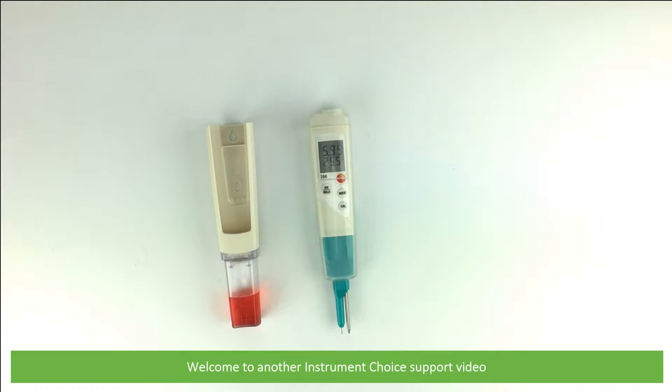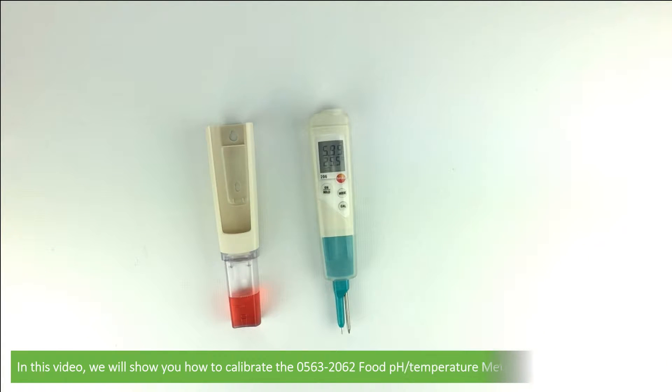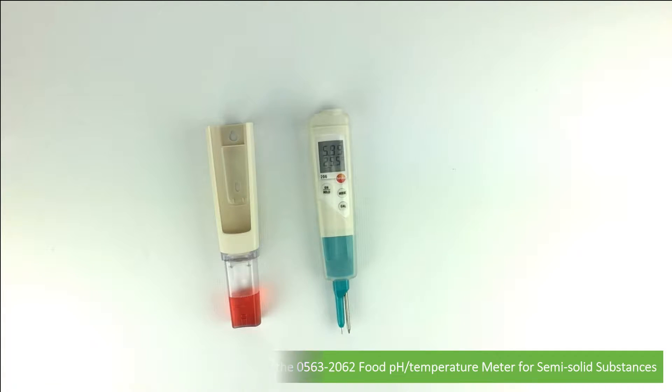Hi and welcome to another Instrument Choice support video. In this video we'll show you how to calibrate the 05632062 food pH and temperature meter for semi-solid substances.